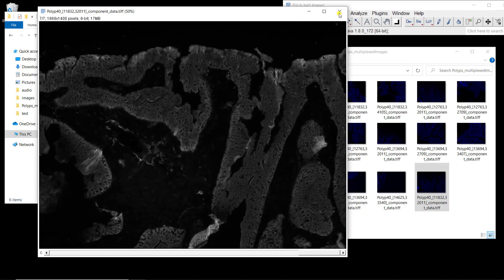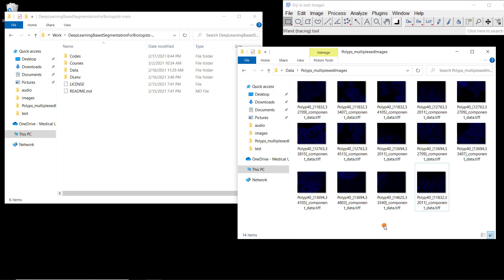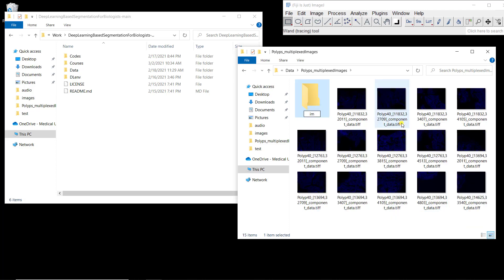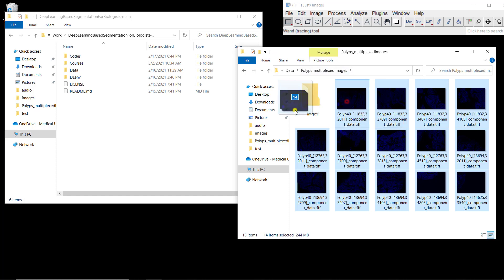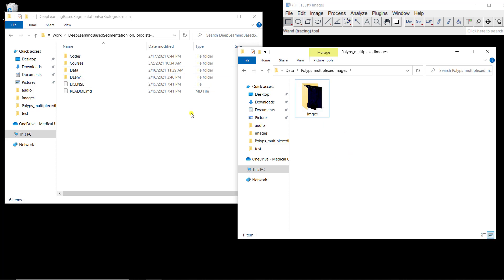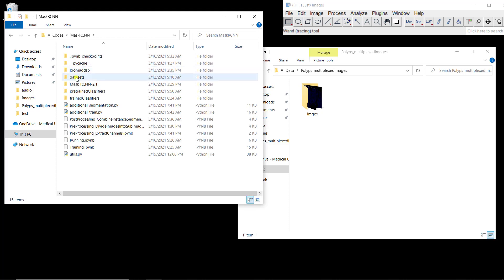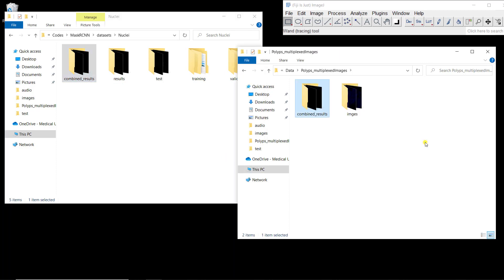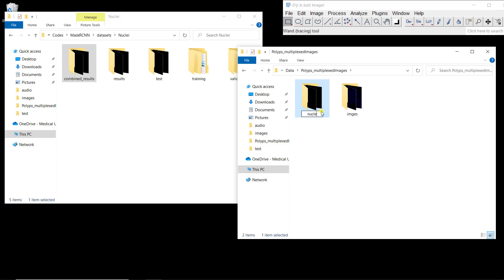To do all the processing we're going to need the nuclei segmentation and the tissue segmentation. I'm going to create a folder here called 'images' and put all the images in this folder. Then I'm going to copy and paste the nuclei segmentation — going to codes, mask or CNN, datasets, nuclei, combine results. I'll use these as the best nuclei segmentation we obtained, and I'm going to call this folder 'nuclei'.